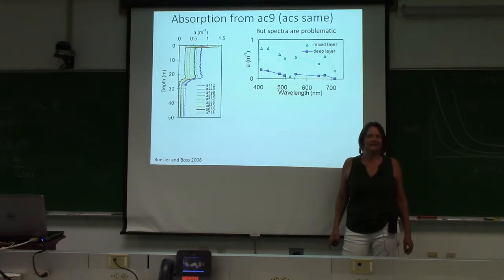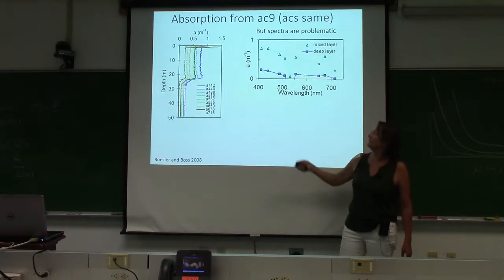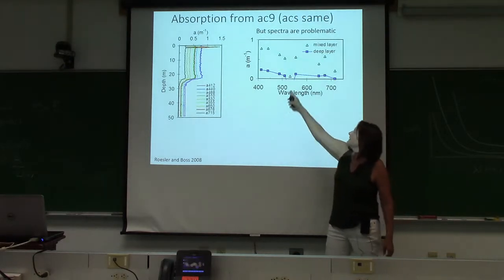What looks like that? Can you think of, is there any discernible component in those absorption spectra? Got a nice red peak, so maybe that's chlorophyll, but what's this? And why is it negative?